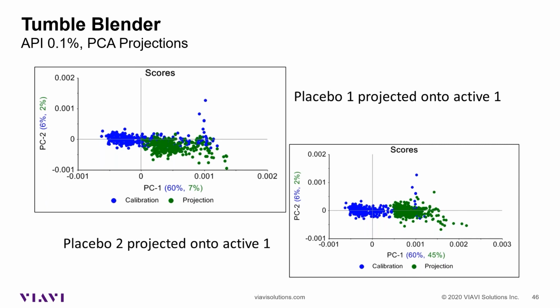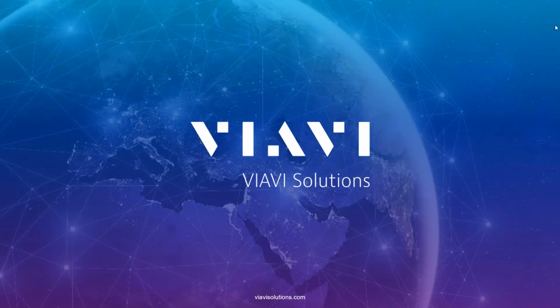Obviously, monitoring something that is 1% or 5% is very easy. When you have to go down to 0.1%, you need to do something more, diving deeper into the multivariate analysis. This is the last slide from my side. I am making Cristina presenter, and she will drive you through the software side with a nice hands-on.